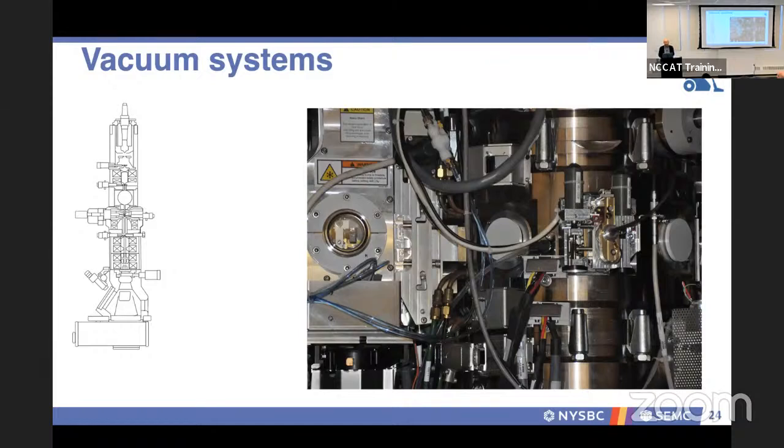That depends on how frequently you use the microscope. On a screening microscope, there can be a situation where you don't necessarily need to cryocycle the column, but you do the autoloader, because that's where you're doing a lot of sample exchanges. But that doesn't mean you can use the microscope if you're only cryocycling one part and not the other.